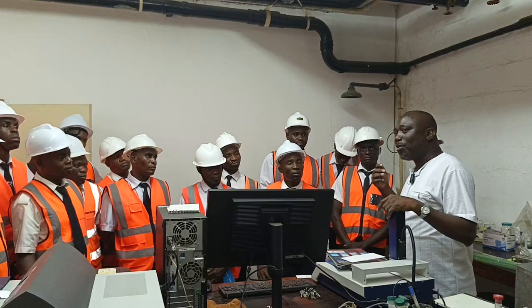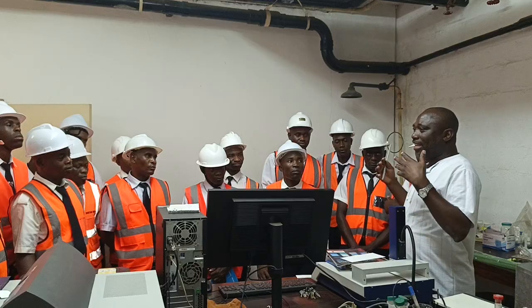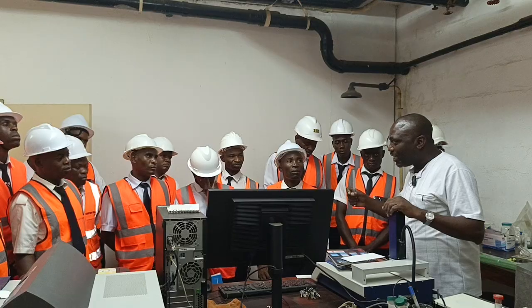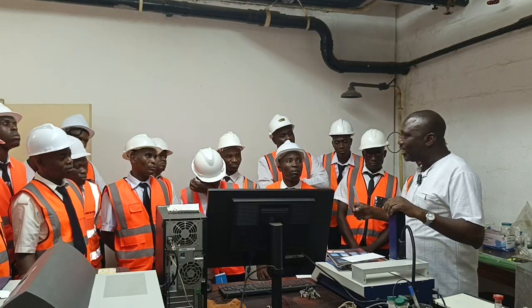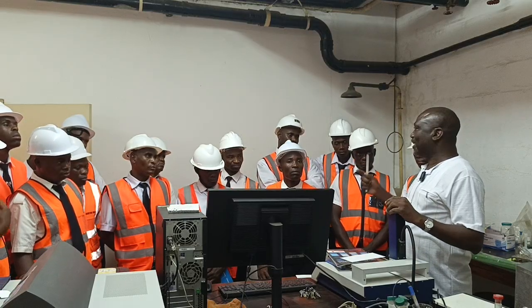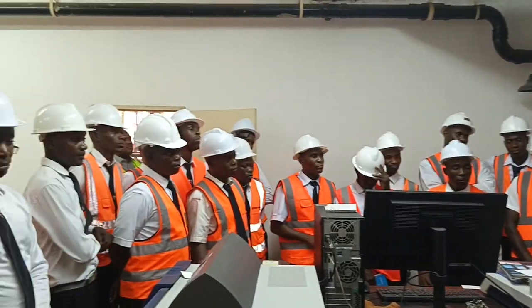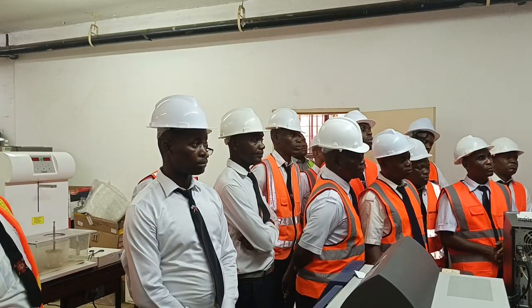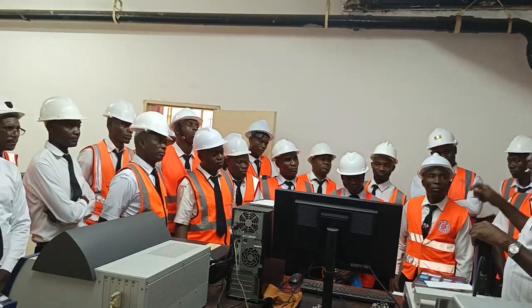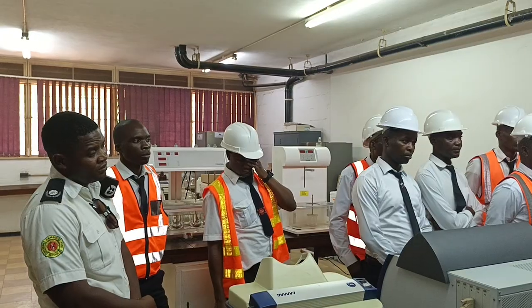And because you are all investigators here, chief investigators or investigators, in any investigation of scientific nature, sample collection, sample storage, and sample preparation is very, very catchy. How do you get a sample from the scene? How are you going to store the sample? And how are you going to prepare it in the lab? So what takes a lot of time is how to prepare the sample before it comes onto the plate.